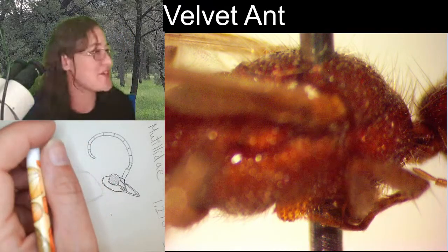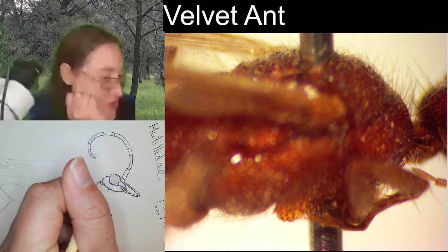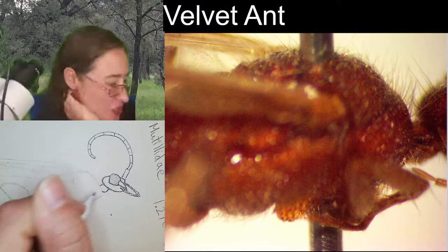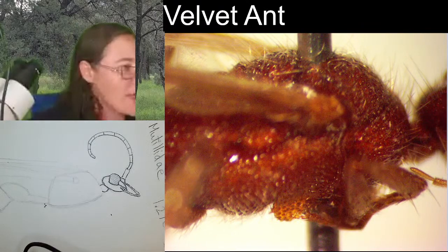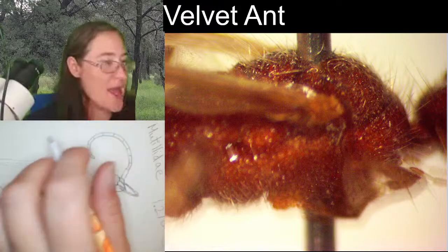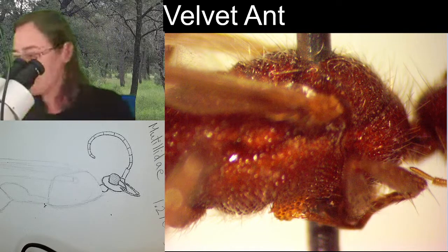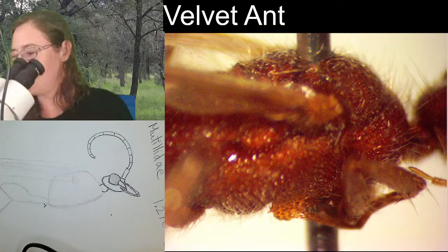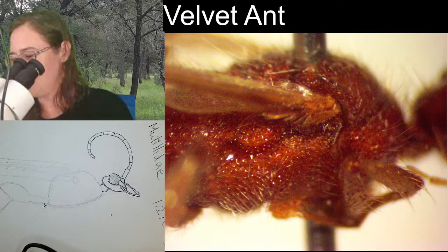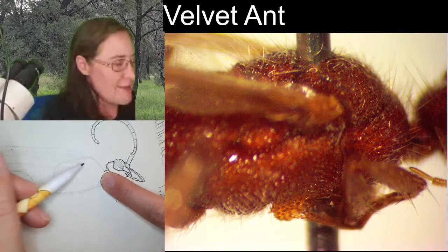Alrighty, up here at the top, we're gonna go ahead and darken this. The neck region is flat on the top, but it is arched down on the bottom, and then we do have a number of segments here. You can see the sutures, or the division between the exoskeleton plates, which is kind of cool. To help you out, I'm going to draw the plates a little bit lightly, and then I'll darken them in.